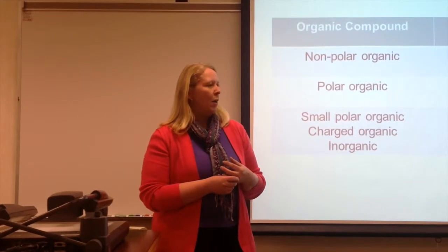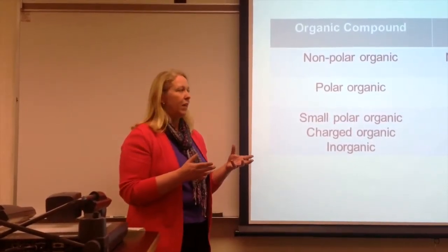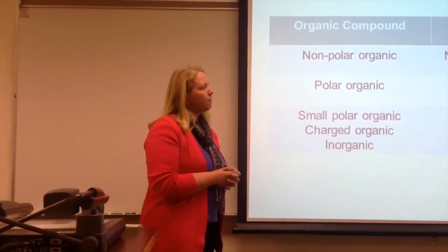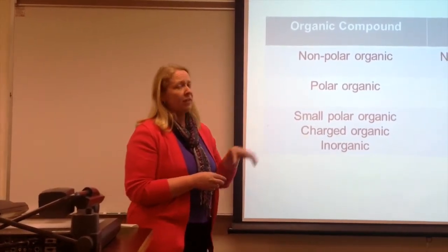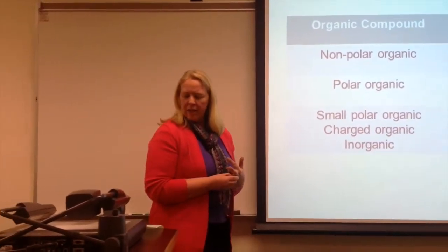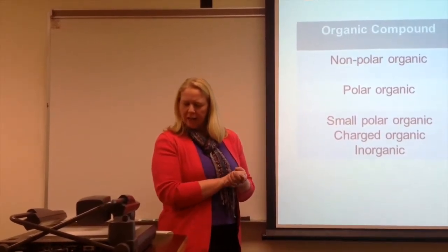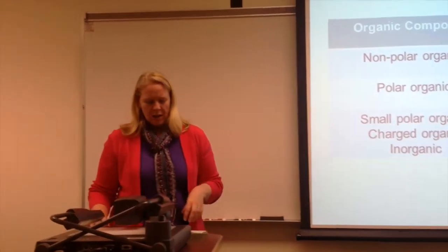And today, or this week, we're going to talk about extractions, and more specifically liquid-liquid extractions. All of these workups, the techniques that we're learning, are useful for working up chemical reactions that we're going to be doing throughout the year, and you're basically just learning the techniques right now.